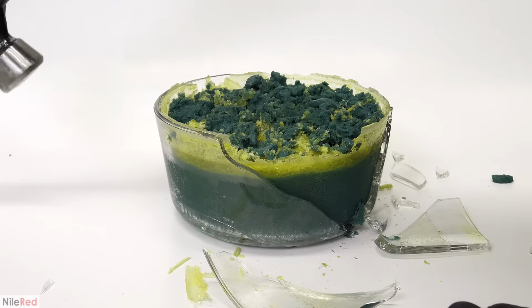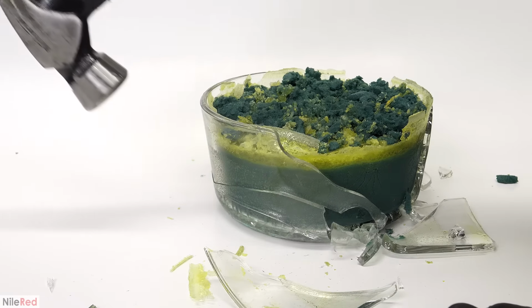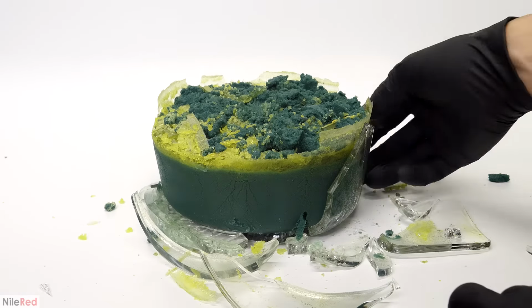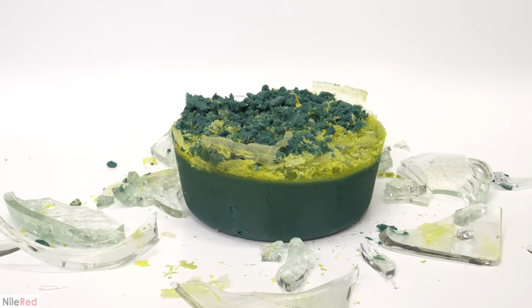I now had a bit of a glass mess to deal with, but it wasn't a huge problem. I just smashed a bunch of it with a hammer, and then manually peeled away the rest. All the glass was thrown into my glass waste bin, and I didn't really care about the bowl because I think it cost me like $2. The chunk that I was left with was surprisingly well formed, but when I picked it up, I could tell that it was still full of water.